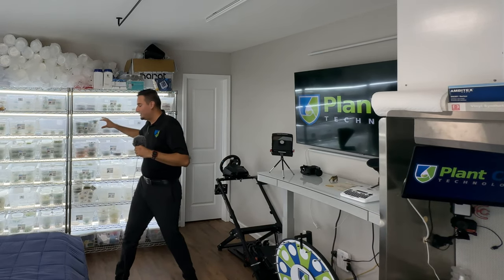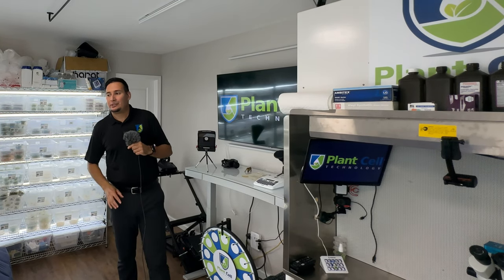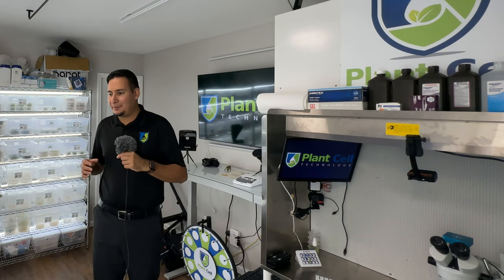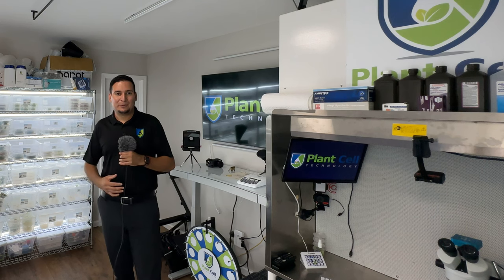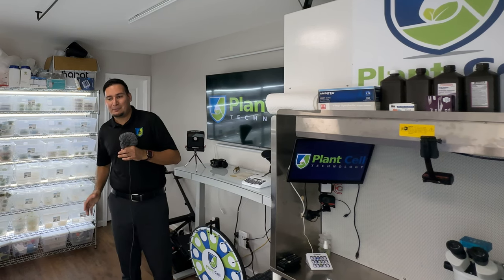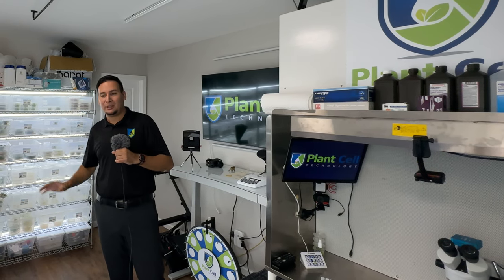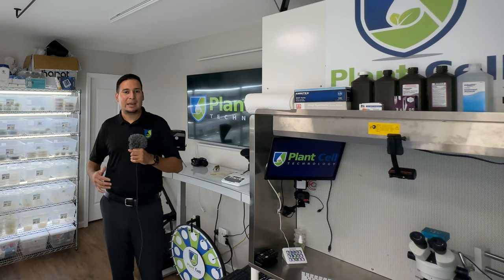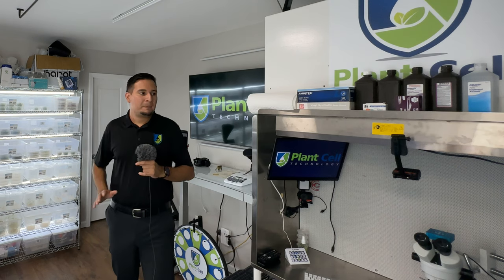Each container is a different species of plant. I want to be completely honest — I haven't done a lot of tissue culture lately. I actually have two jobs: Plant Cell Technology is my second job in the afternoon, and in the morning I work for the University of Tennessee. So I haven't had that much time to do my tissue culture work.